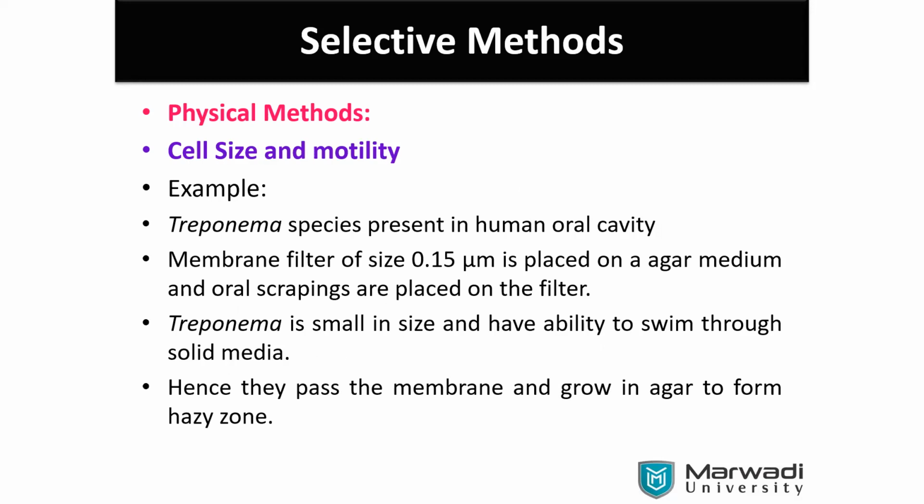Have you done that experiment? Hanging drop? No. Okay. I just forgot to bring the marker. No problem. I can give a few examples. Generally, you have seen glass slides. What is their surface? It is flat on both sides. While in the case of a cavity slide, these are specifically available. It's like a watch glass. It is a slide only. The middle part is somewhat thick. Over the middle part, there is a notch, like a round bowl-like structure. So what we can do is put our sample.